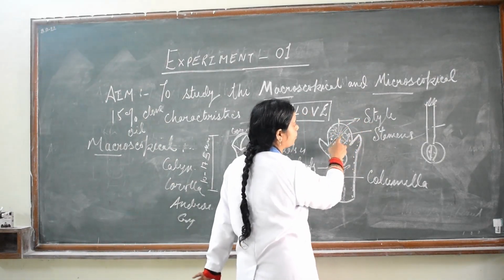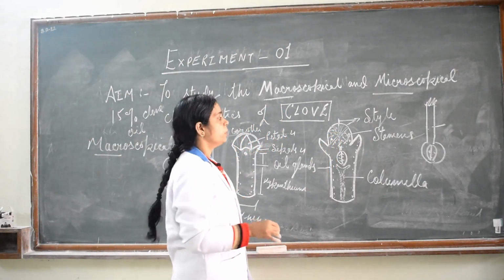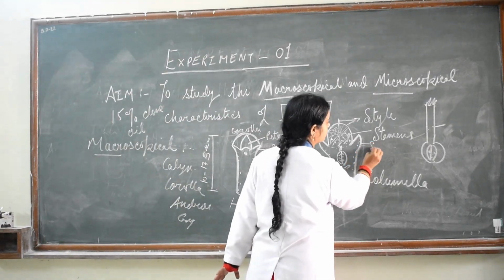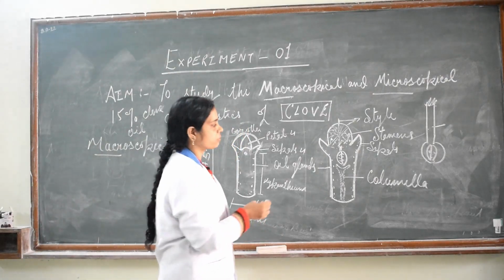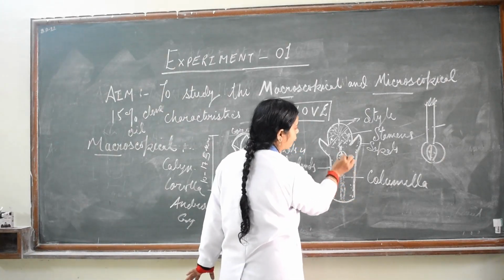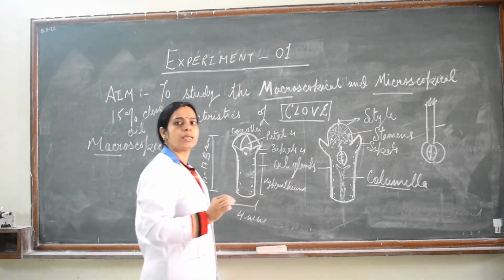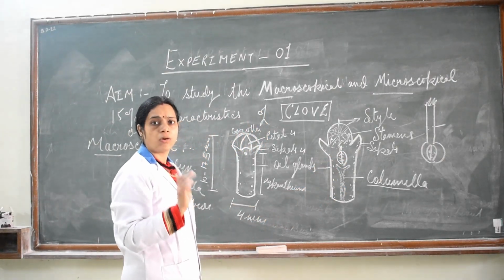And what are these? Pollen grains are present here. What are pollen grains? Pollen grains are part of the androecium. So all the 4 whorls are present here also. Stamens, style, petals, corolla. These are the sepals. So sepals are part of the calyx. The first one is sepal only, and oil glands are present here also. And after the ovary, there is a structure called the columella. So what is the columella? Columella is a support for the ovary; you can see the ovary is sitting on the columella.